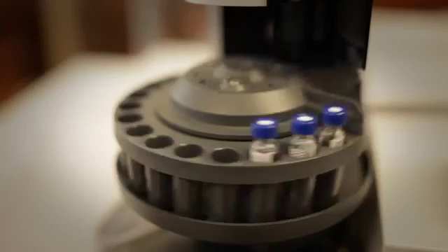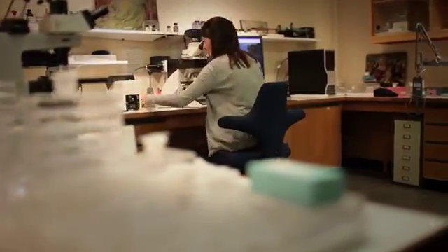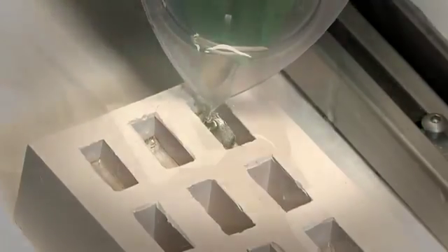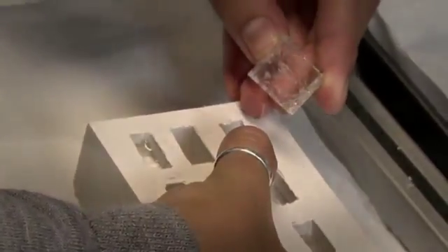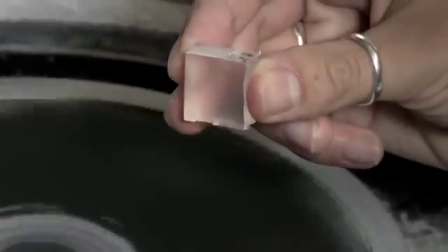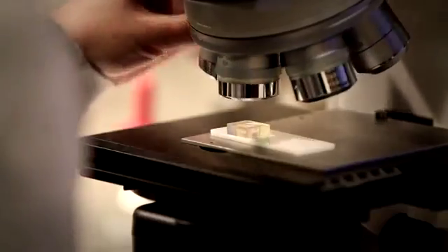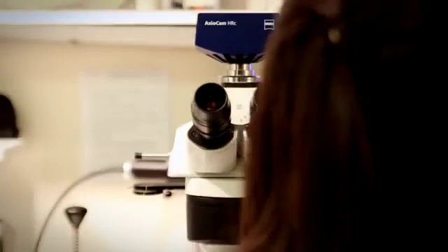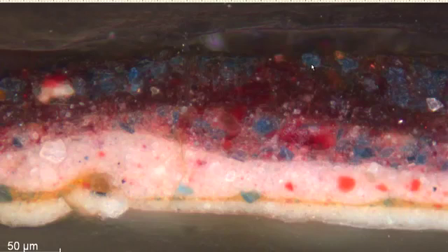At the National Gallery Scientific Department, a tiny sample of paint, usually taken from the edge or from underneath the frame of a picture, is immersed in resin, dried, and then ground down to produce a cross-section. This cross-section can be examined at high magnification under a microscope. This sample clearly shows separate blue and red pigment particles.